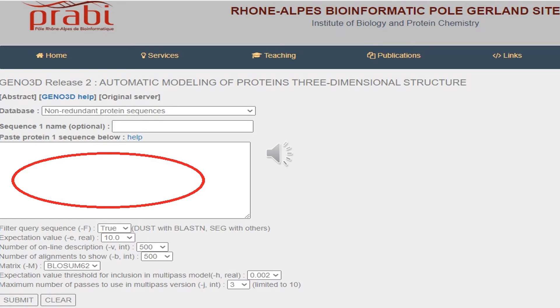Thirdly, you perform the alignment of both the query and subject sequence. Then, step four, we extract geometrical restraints for the corresponding atoms between the query and the template. The fifth step is to perform the 3D construction of the protein using a distance geometry approach. Finally, step six, the server sends you the results through your email.